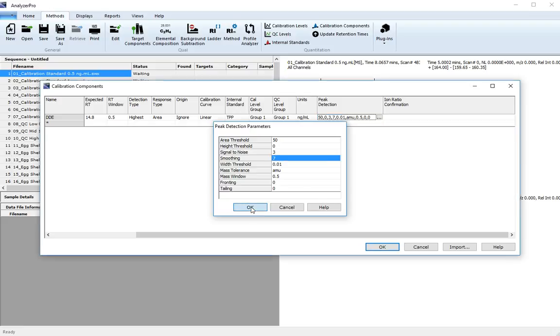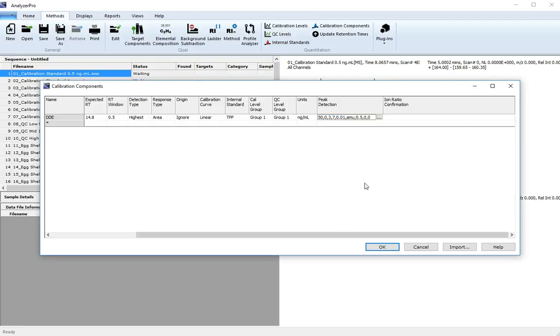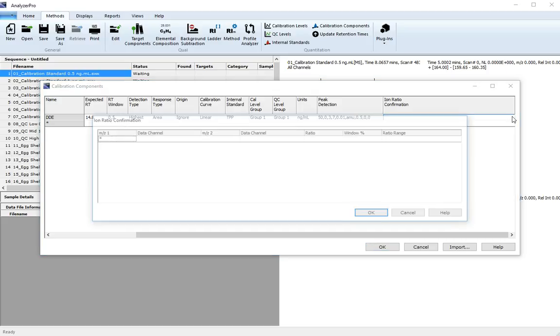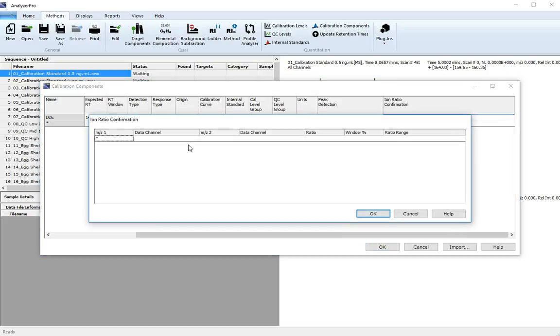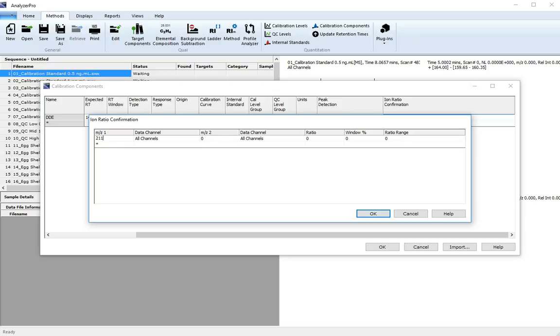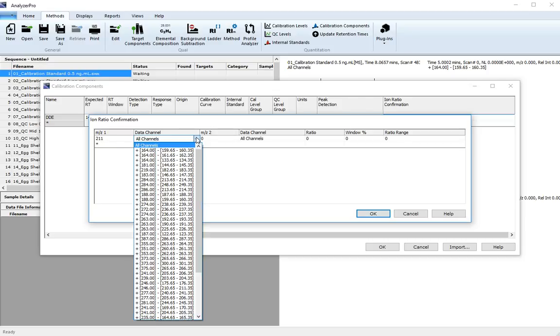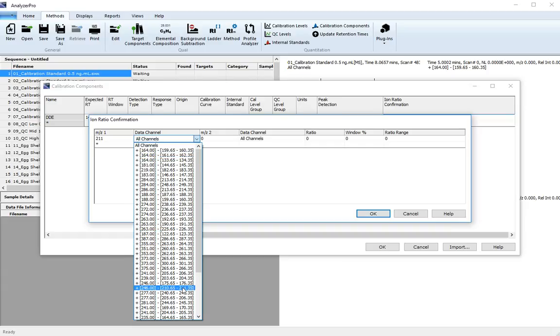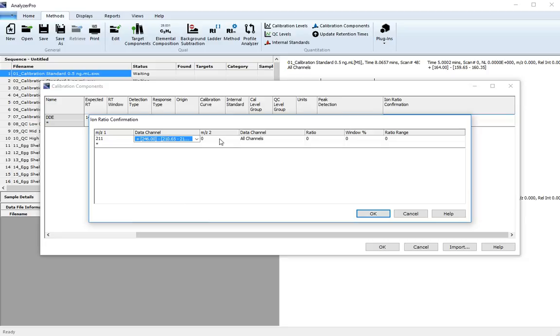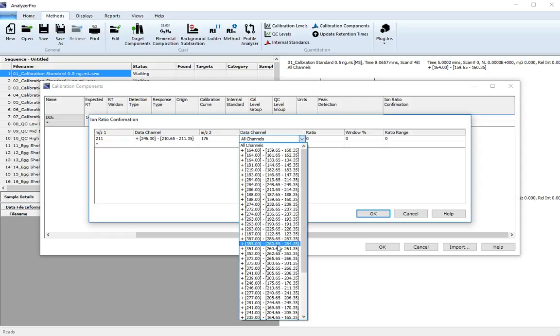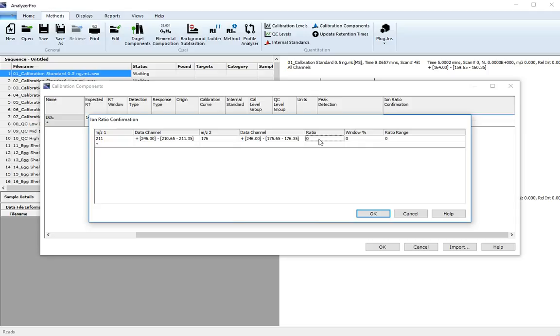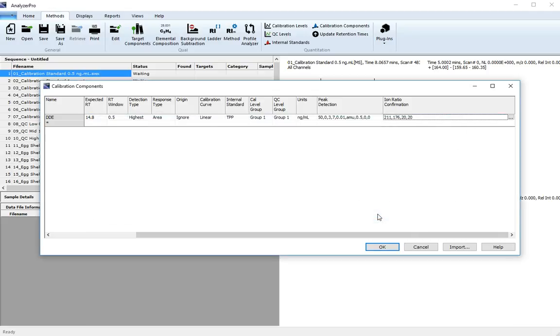Click OK and now set your ion ratio confirmation parameters. The master charge we'll use is 211 to 176. The ratio is 20%, and the ratio range is calculated for you. Click OK.